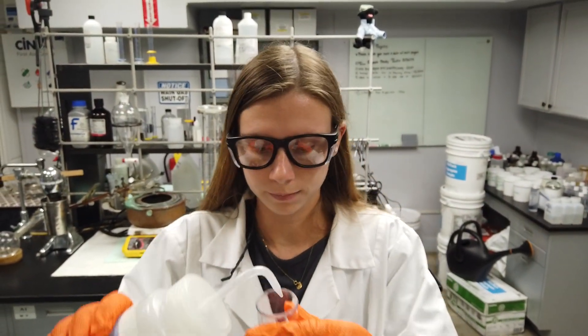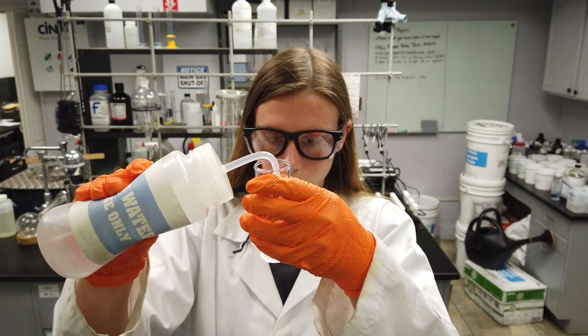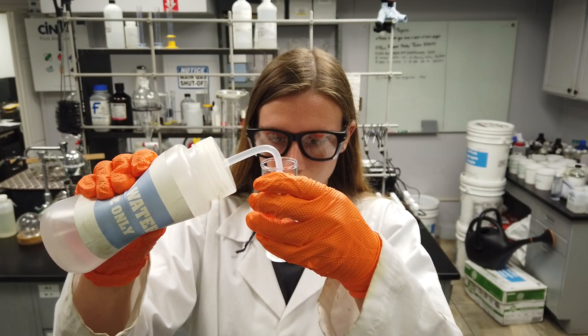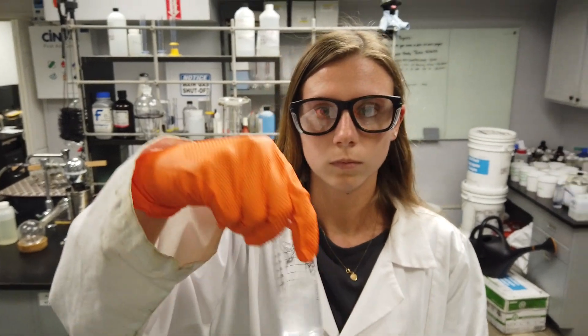Then dilute to the 25 milliliter mark with water. Using the two-gram scoop, add one scoop of the Acid Sulphate Crystals and swirl to dissolve.